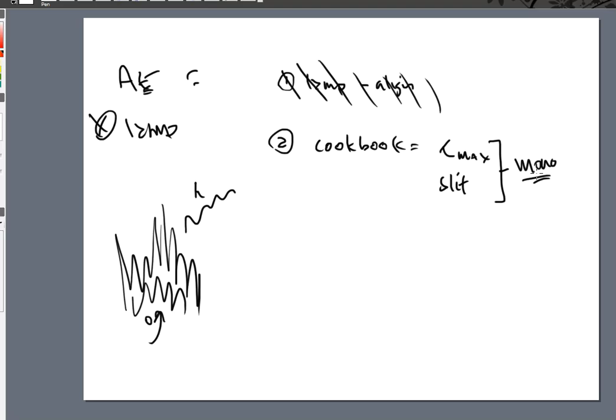Instead, what we're doing is that we are double checking the wavelength and the slit width for the monochromator. That is what's built into the software for atomic emission. And once we do that, we are fine-tuning the eyeballs of the machine to see certain things. And now it knows I need to see sodium.